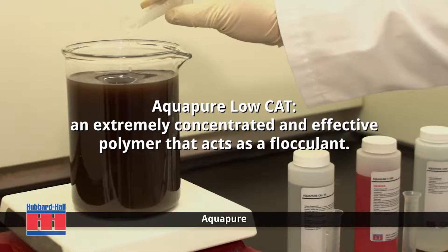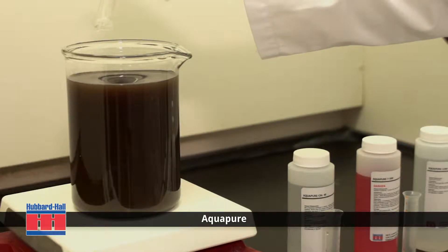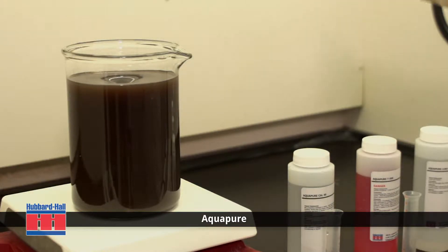The AquaPure Low Cat acts as a flocculant that binds the metals together and increases the density, causing the copper metals to drop to the bottom of the tank.